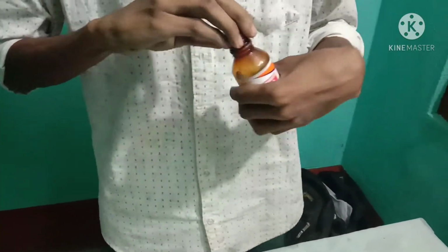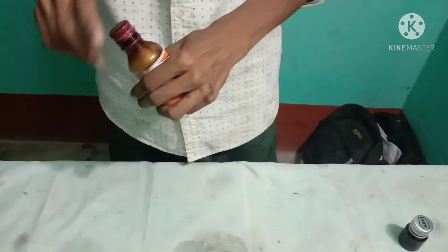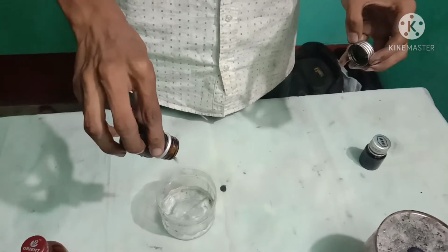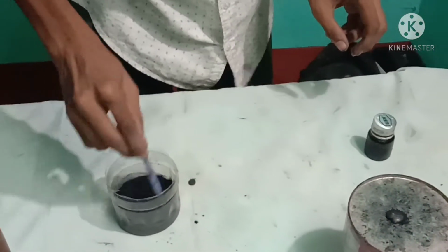So first we pour a little amount of hydrogen peroxide, and lastly we'll add some manganese dioxide. Okay, I'll just stir it for a better reaction.